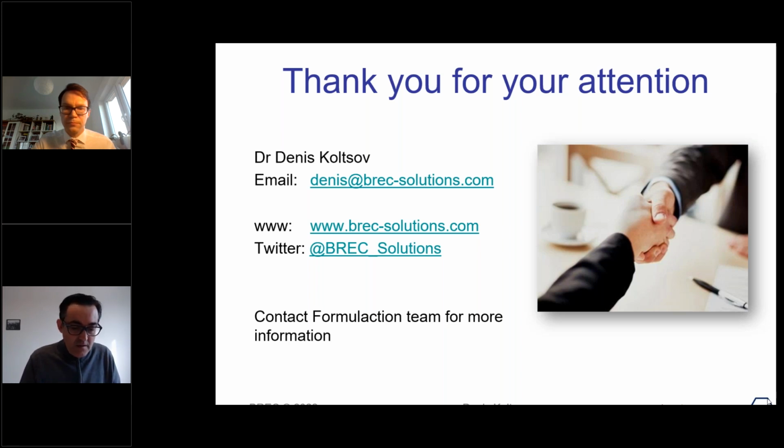Maybe the last question, Denis. Is there any correlation between the mean size you measured with SMLS and other size measurements done by diffraction technique, such as particle size analyzer or the particle size distribution? Is there any correlation or any number that correlates? Yes, we actually tried to do that, but in the end, some of the connoisseurs of other techniques said, well, no, you shouldn't do that, because they felt that the scope of the document isn't to talk about other techniques, it was just to talk about SMLS. So we were a little bit upset because we actually wanted that comparison, but it was not to be.